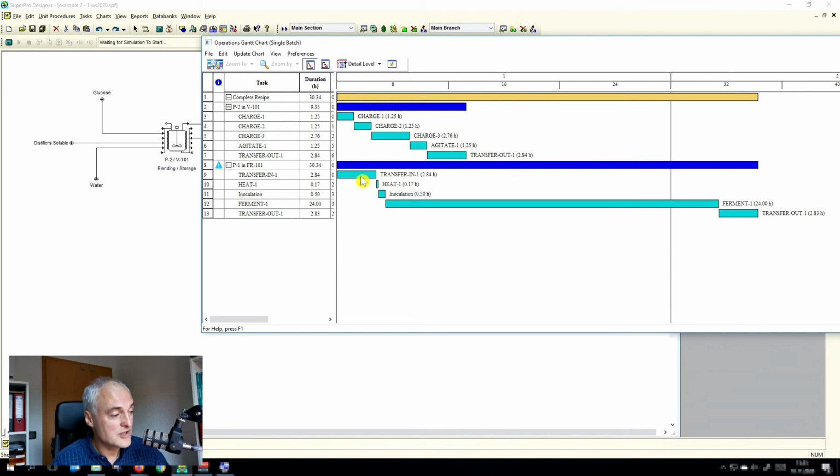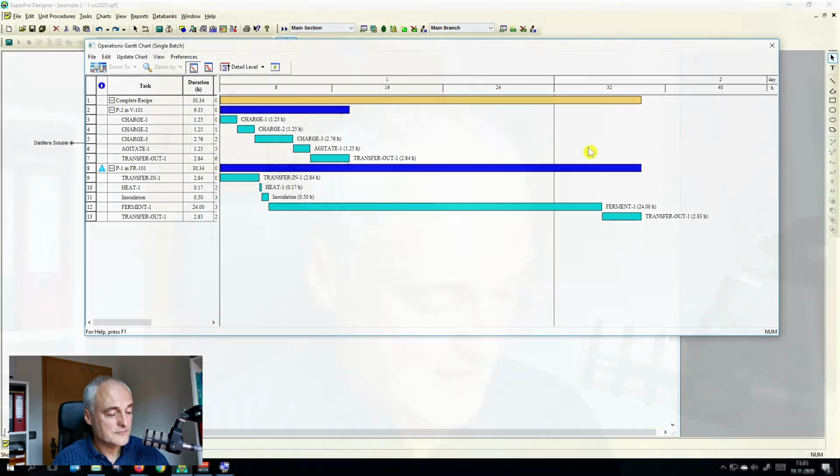So this transfer in operation, of course, should start at the same time as this transfer out operation here starts. And then it should also take the same amount of time as this transfer out operation. Only then it makes sense. So therefore, the complete process here should start there. And of course, there is a way to tell the software to do that. So we're at point 2.2.3, schedule operations. So what we need to do now is tell the operations when to start.